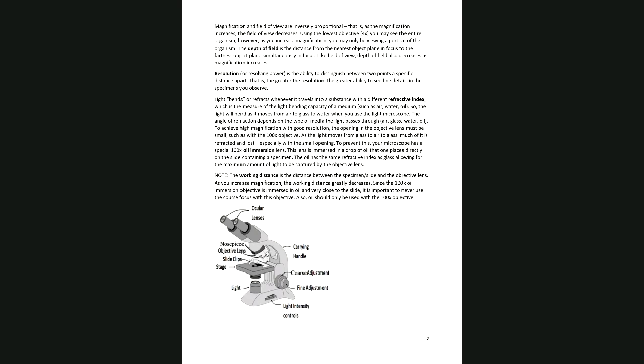Why is 40x the high dry lens? Because it's the highest magnification without needing oil. Right, and in fact, you should never use oil on the dry lens. But having said that, it's likely the student before you may not have cleaned their microscope that well.